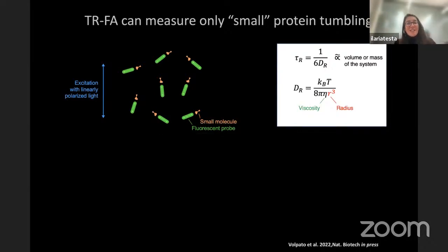And you may ask, why do we need that? Well, how do we measure binding, for example? For a very long time, and Lionel knows this well, because there was a very big school that he has been involved with doing fluorescence anisotropy to measure how the dipole orientation of the molecule relaxes over time, and then infer something about the binding or not.